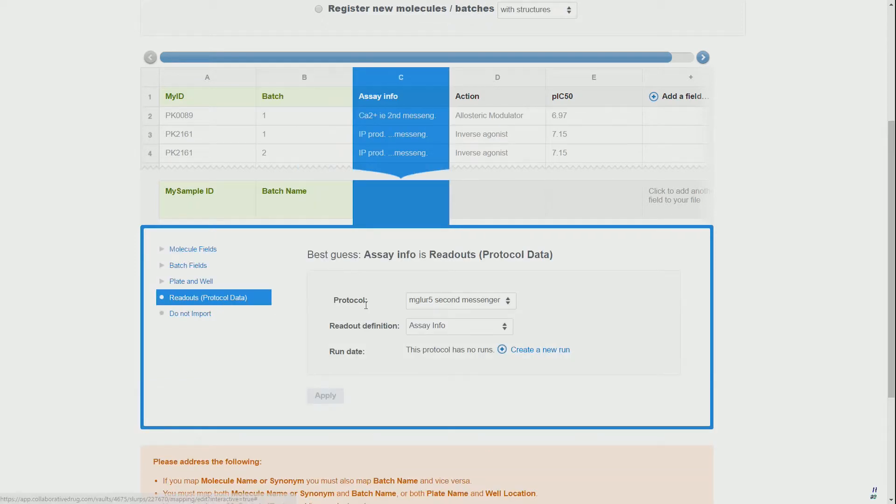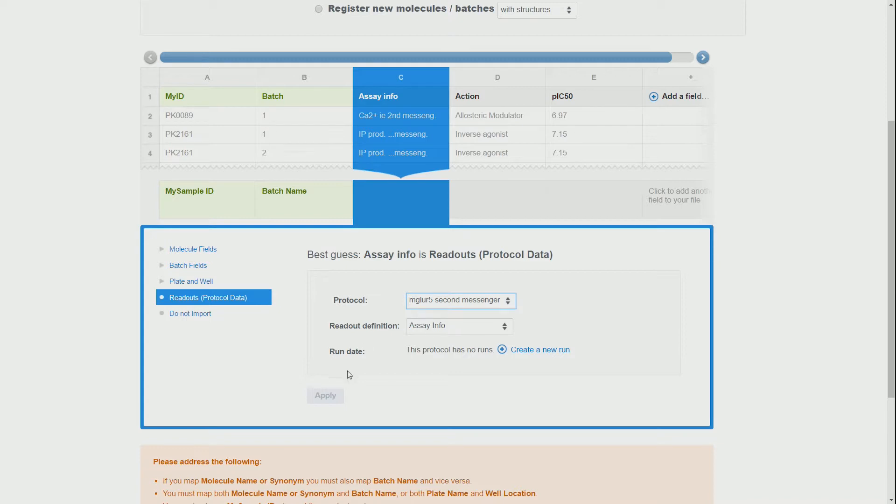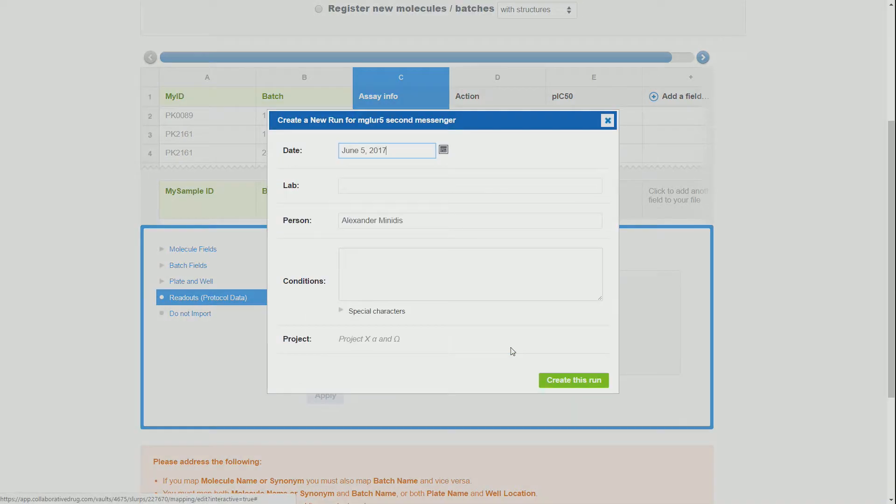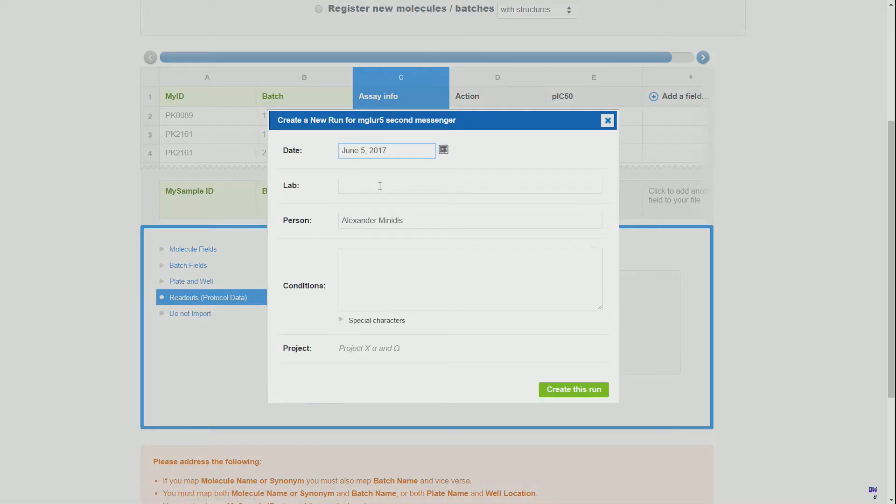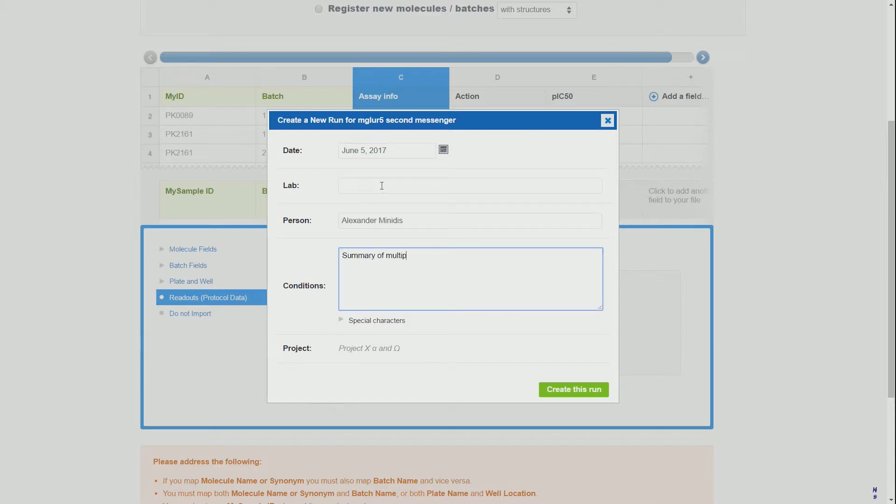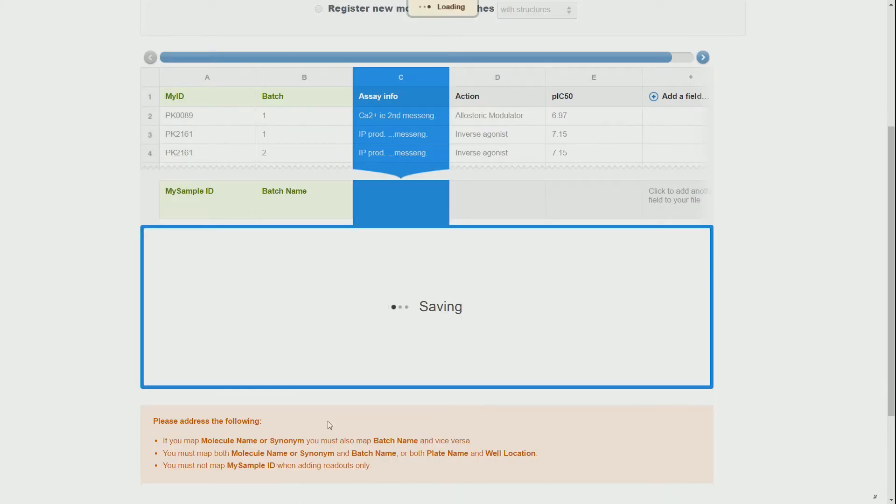Now finally we get to the point where we can import or respectively assign the SA data, for which we create a new run, and we finish by assigning all the other columns.